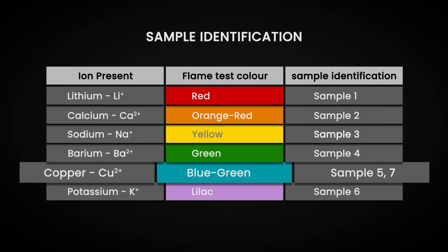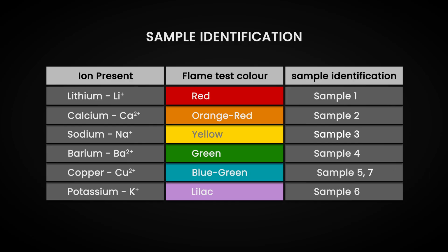Solid sample 5 is green and solution sample 7 is blue, however, both produce blue-green flame color, indicating the presence of copper in both samples. This implies that color does not provide conclusive observation.